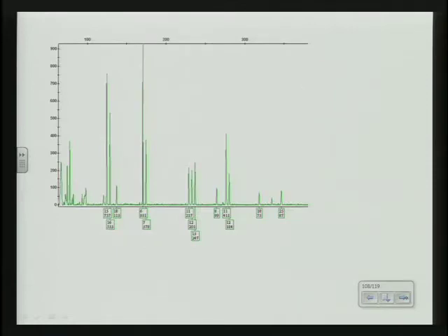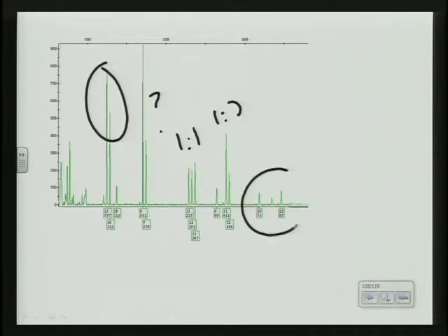You get down here, you see something going on, but you can potentially think that, okay, you've got a major component here. Start working down, now you're closer to a 1-to-1, maybe 1-to-1-ish, who knows what. But then down here you just have 2 alleles. And without thinking that this may be a degraded sample, you might think that when you get down here, this is the major component that's just gotten a little bit low because it's the high molecular weight.